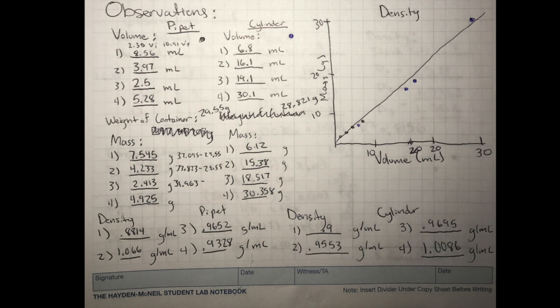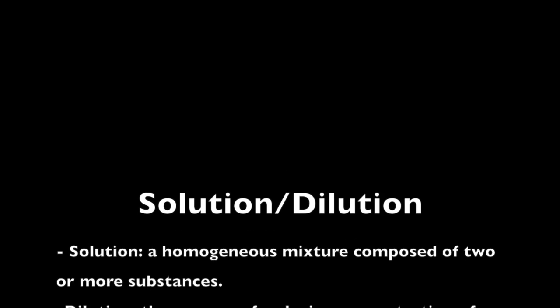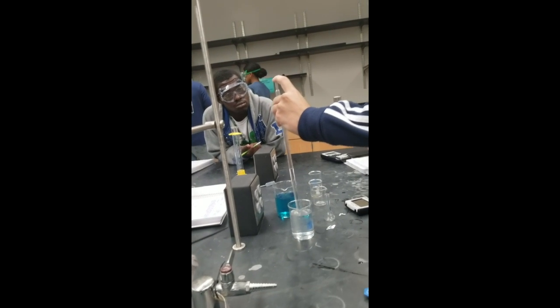Mass, volume, density data. Here's our data that we collected, solution versus dilution. Solution in dilution's terms. We are now pipetting the water, measuring it, then putting the rest into the 25 milliliter container.